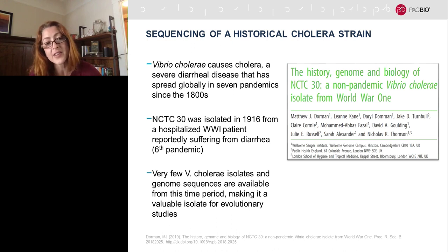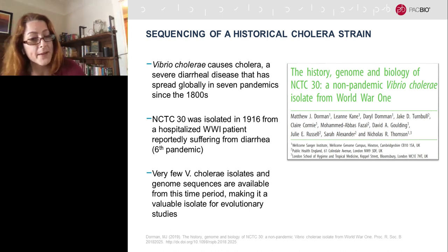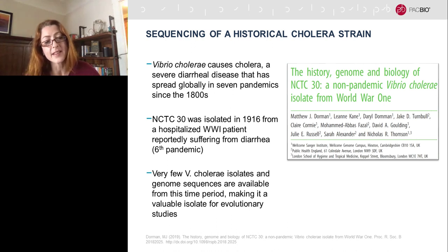We are currently in the 7th, or some might argue that we're past the 7th and we may be entering an 8th pandemic. But in any event, this one was super interesting because while we have a number of strains that were collected during the height of the pandemic, this one is interesting because it's toward the tail end.